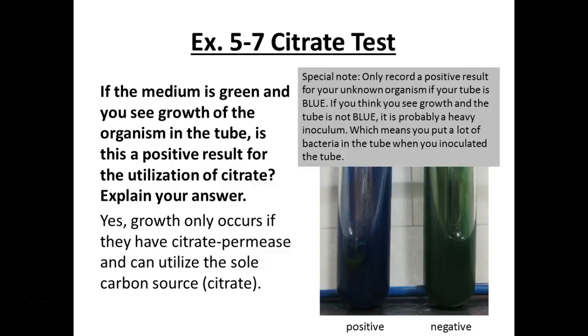Okay. So sometimes some scientists will actually stab the butt end down here with a needle instead of just inoculating the slant. I don't mess with that for you guys because we incubate it long enough that if it's positive, it turns blue. No problem there.